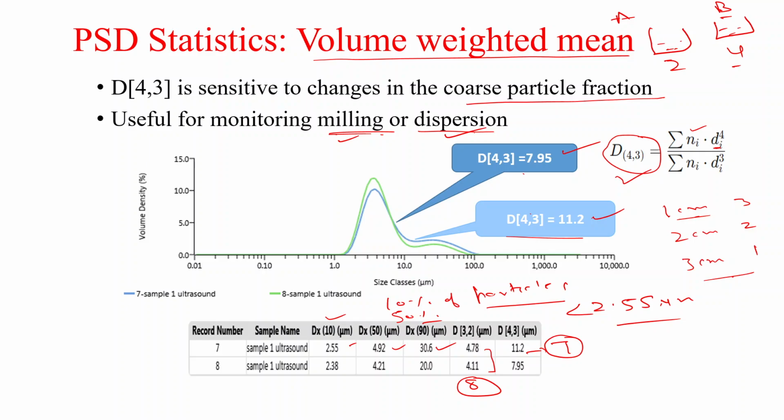These values have significance, and which values to be used for what kind of application can be decided considering the changes which we are expecting and the type of particles which can be there in the solution. That parameter is to be selected. Otherwise the instrument gives all these values for the particular kind of sample, and we can interpret the results accordingly.